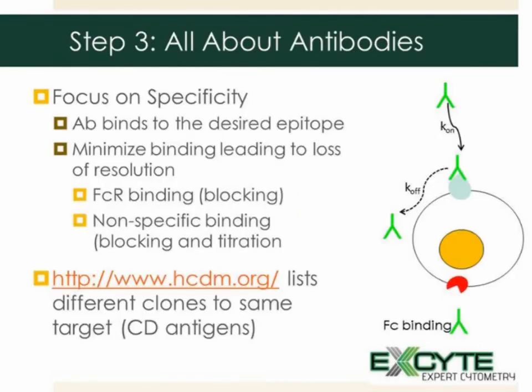Now that we've talked about the instrument, let's discuss antibodies, because the antibodies become our workhorse and are how we phenotypically define our cells of interest. And we're going to focus on the specificity of these antibodies. Overall, what we are focused on is the antibody binding to the desired epitope with a very strong K-on reaction, very slow K-off reaction, so it's not falling off our target, has a high affinity.